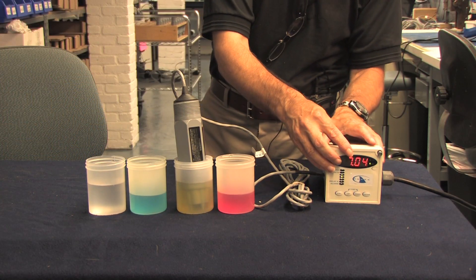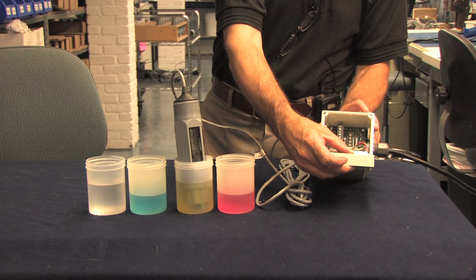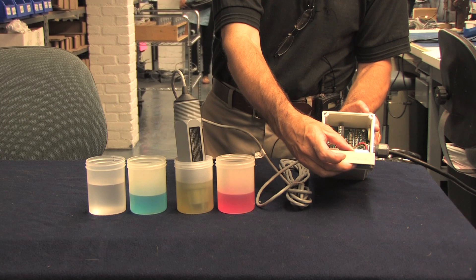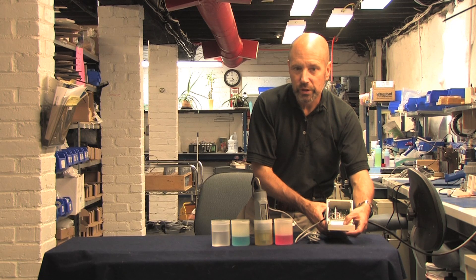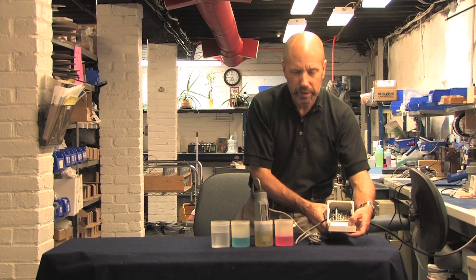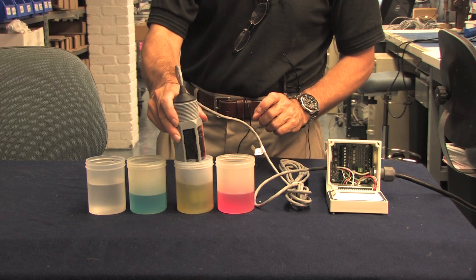We're going to flip down the cover and cycle through the available menus. The fourth menu is titled Diagnostics, and that's what you want. We'll hit the left-right button to bring it up and scroll down until we get to a third item called Sensor Input. Press the left-right button again and you're set to go. Let's start off by putting the probe in pH 7 buffer solution.